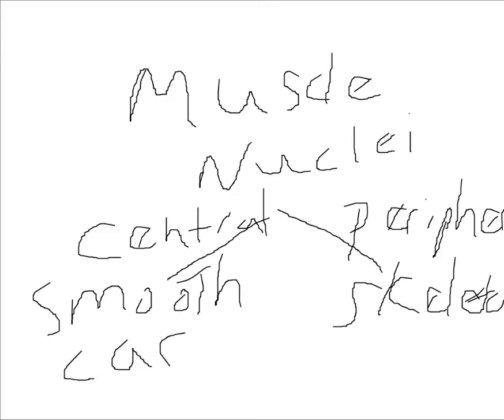Then based on these features, referring back to that picture, which one could we categorize? In some of these it's hard to distinguish which is the cell, but as a general feature, some are multinucleated, some might be binucleated versus single nucleated. So how would we assign that to each category?